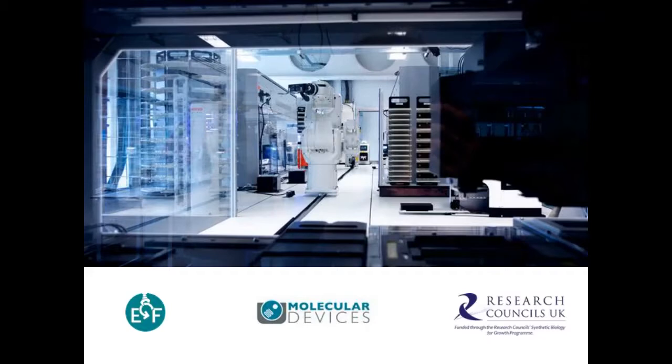A crucial step in DNA assembly is the amplification of DNA in bacteria or yeast. The Qpix can plate out these cells on agar dishes and the next day pick individual colonies for growth. The Qpix is integrated into our robotic platform, and we will describe the process in more detail. Before, let me just briefly present synthetic biology and why this field needs platforms like the Edinburgh Genome Foundry.